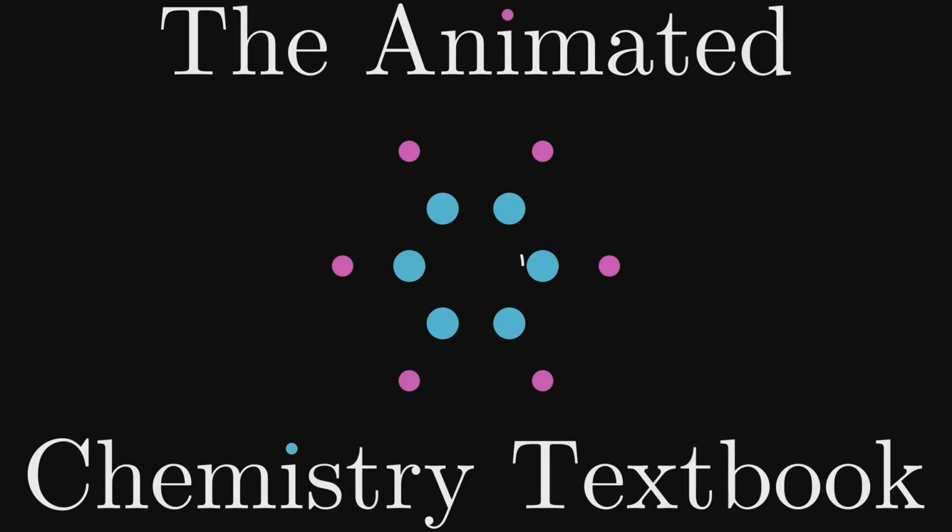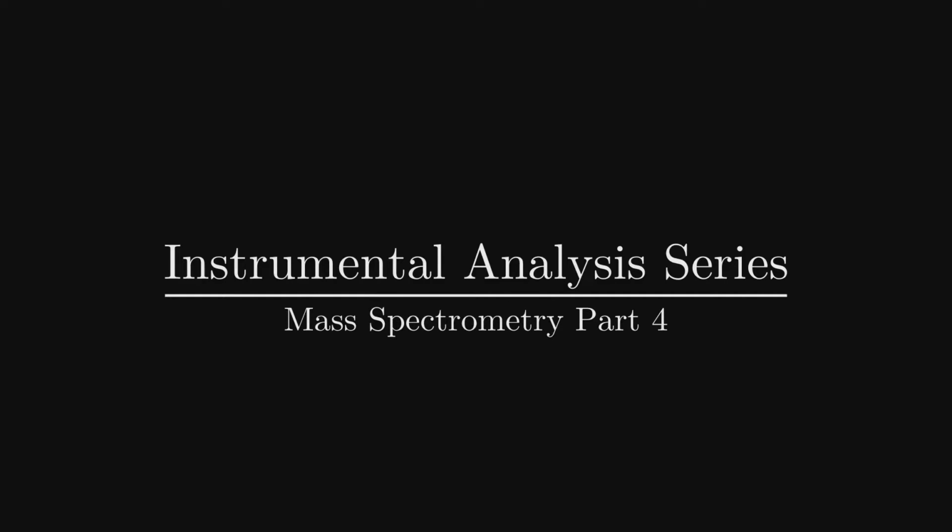Welcome, fellow chemists, to the fourth and final mass spectrometry video in this series. 3 videos ago, we learned how to read a spectrum, and today we will focus on what to expect to see in a spectra of amides, acids, esters, and aromatic compounds.